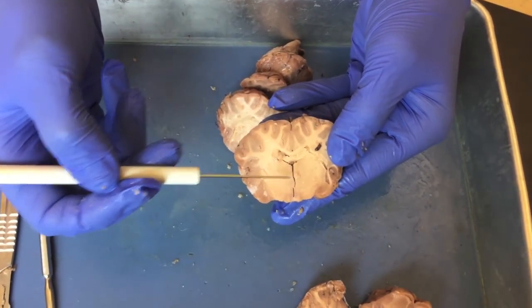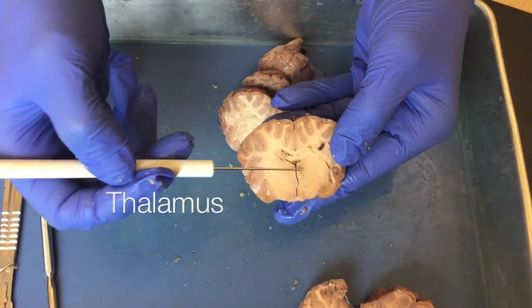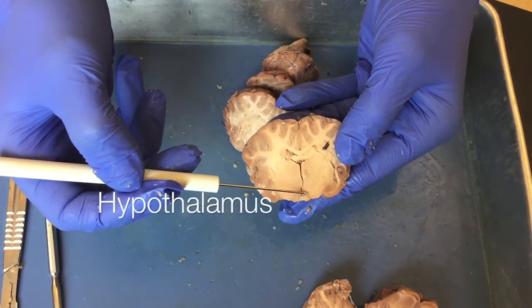Remember that where the third ventricle is, we also have the thalamus located right here and the hypothalamus located right here.